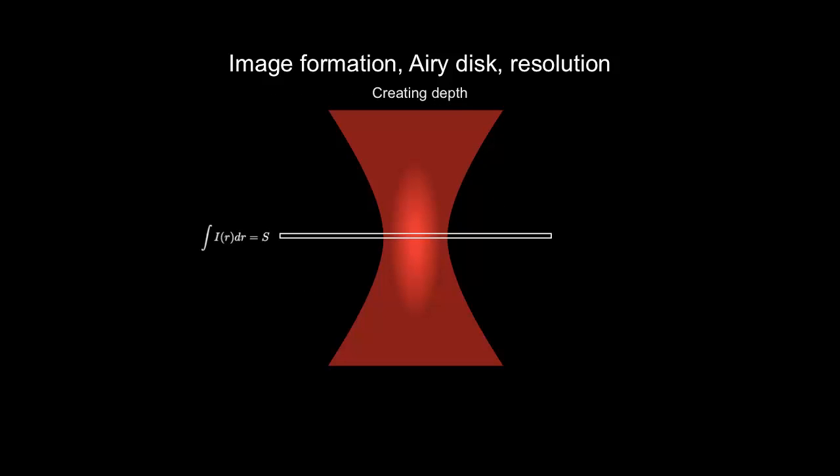That's the result of the integration of the intensity point spread function. It has a maximum when we evaluate it with depth in the confocal case.